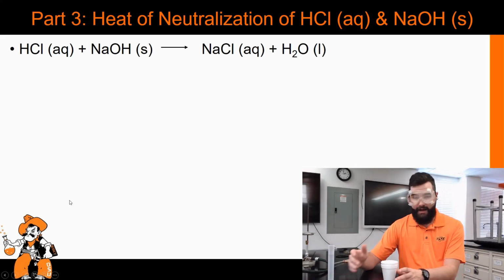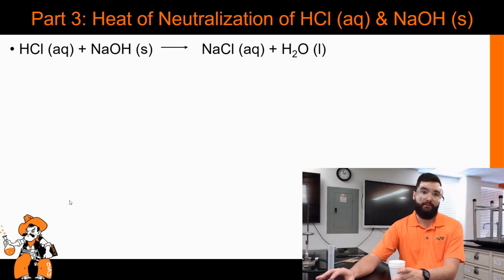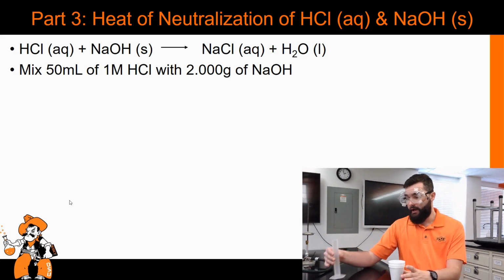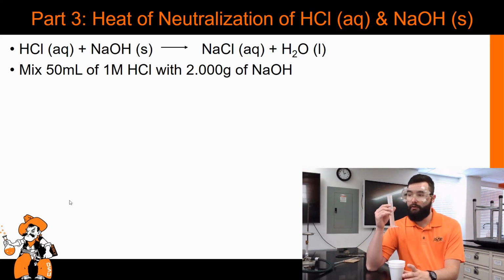So we're back. I weighed out exactly 2.000 grams of sodium hydroxide on the scale. Don't ask me how I did it, I'm magical. I measured out 50 milliliters of 1 molar hydrochloric acid.